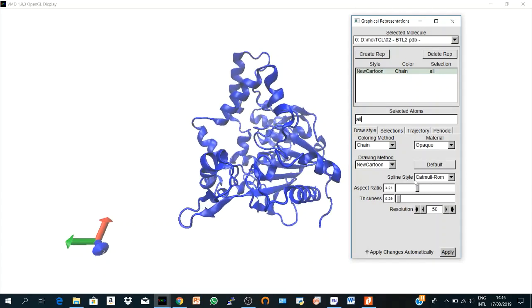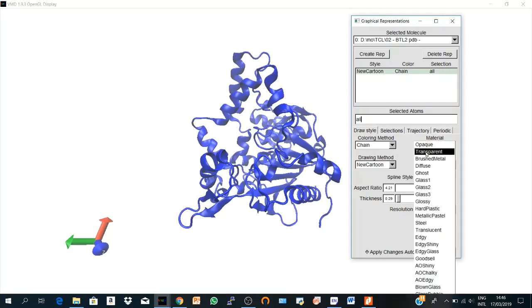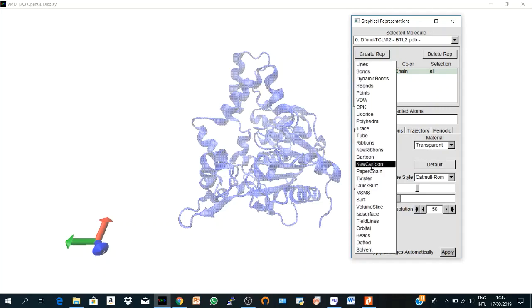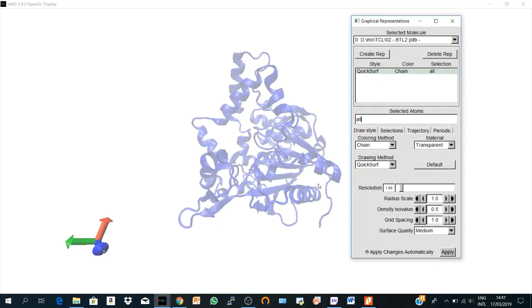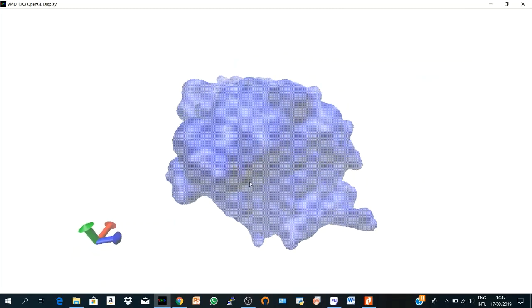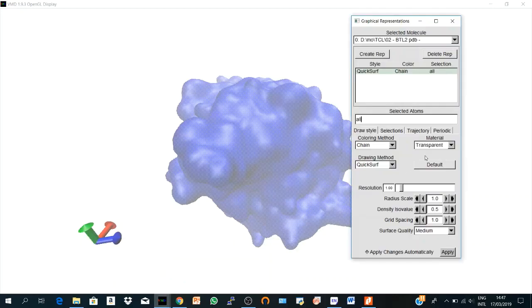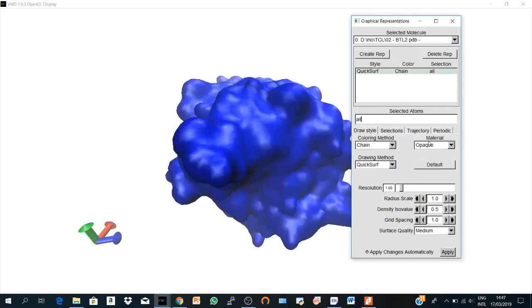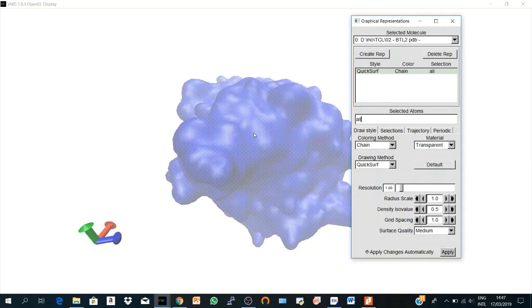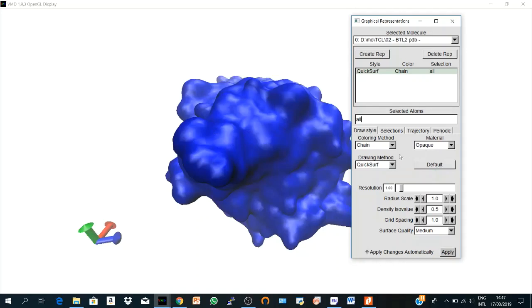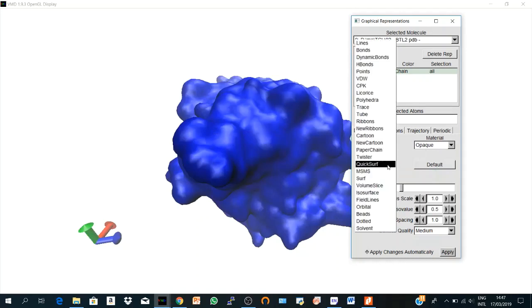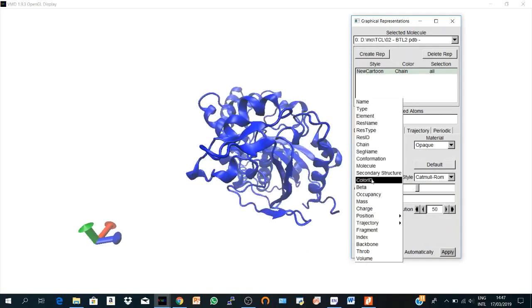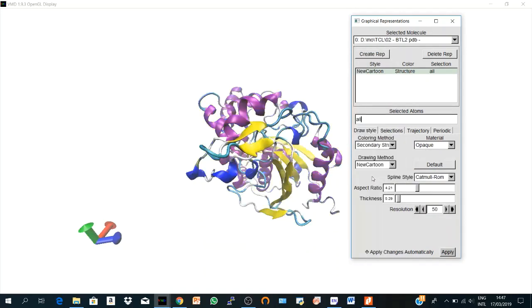And here is the material. It could be transparent, for example, if you want to see something inside the structure. You see here you can't see anything, but if you have another representation inside the structure you are going to see it. So let's get back to New Cartoon and keep it with secondary structure.